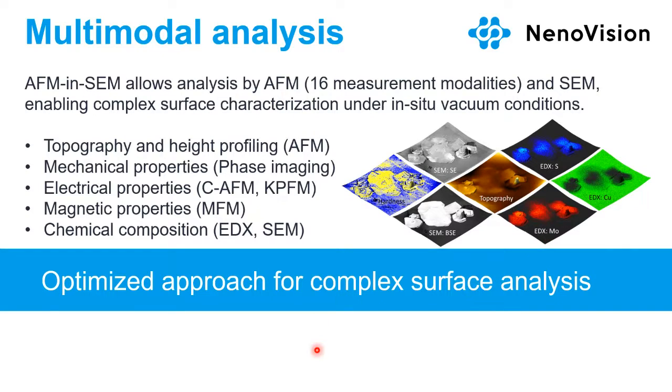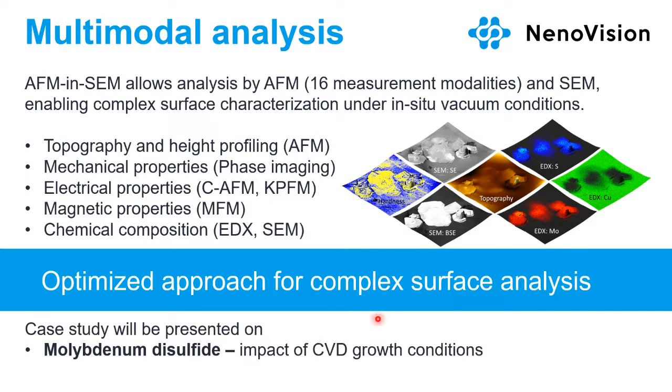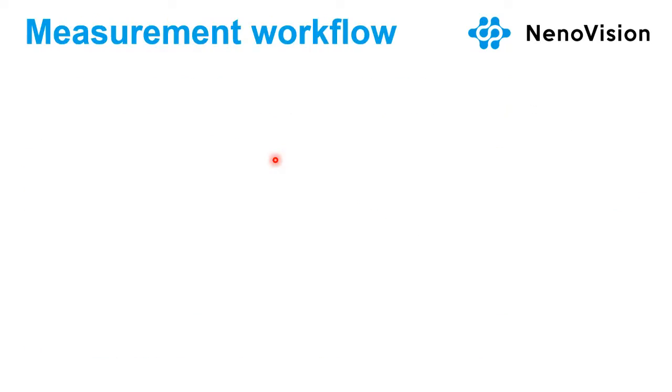So we worked hard to get the optimized approach for complex surface analysis at the nanoscale. We'd like to present it on a case study of molybdenum disulfide. And we'd like to have a look at the impact of CVD growth conditions.